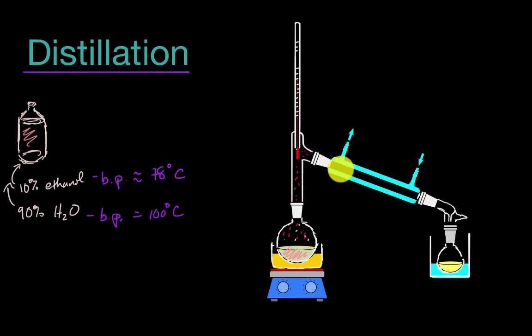And this chamber is essentially what's called a condenser. Separate from the vapor, you're going to make cold water go around this tube right over here, oftentimes a glass tube. Sometimes you might chill it with cold air instead. But you have cold water coming in and going around the tube. It's not mixing with the actual air inside the tube, and then the water comes out of the tube. But what it does is lower the temperature in that tube.